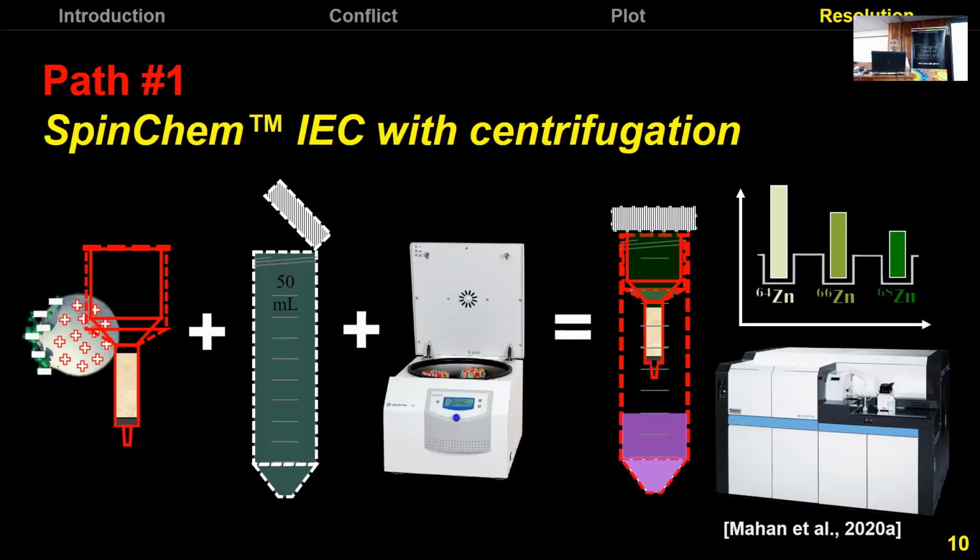So one thing that I have developed and am bringing to JCU is what we've called spin chem. It turns out instead of using a big automated syringe-driven device, you can just chuck these things into a big centrifuge tube, stick it in a centrifuge, make sure you've got your speed right, and you get higher flow through your column. And that will do the same job with the same accuracy and the same precision, but about 5 to 10 times faster. So pretty convenient. Most labs already have a centrifuge, so it's pretty easy to build that into existing protocols.